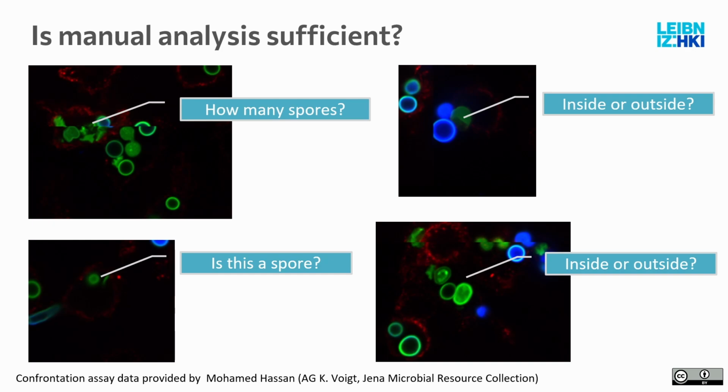So how many spores are those? This is unfortunately directly at the tiling border. So which ones are spores, which ones are some debris that has been left over? What is with this weird tiling border where the stitching was not correctly applied? How many spores are there?